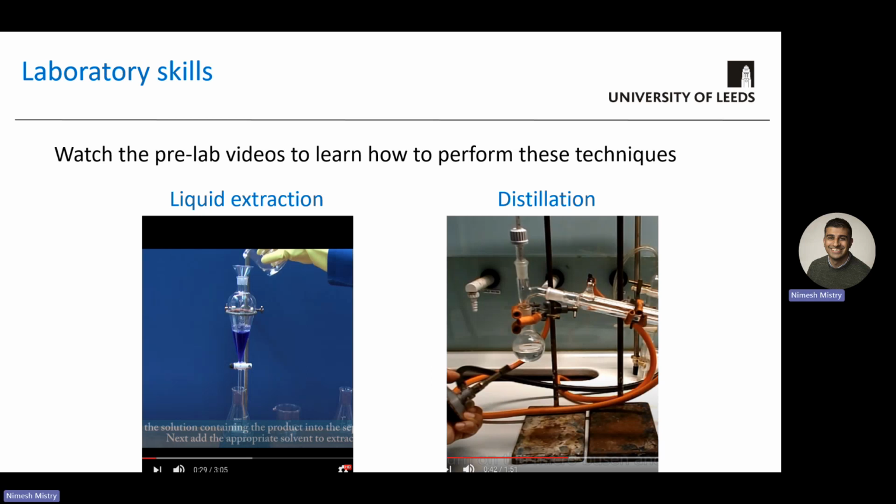So in the following pre-lab videos, they will show you how to perform these key techniques, and also the associated theory video will explain to you, why do we do a liquid-liquid extraction? How does it actually work? How does a distillation work as well?